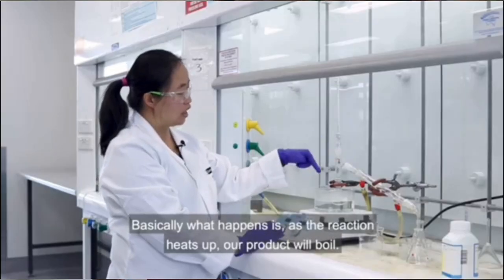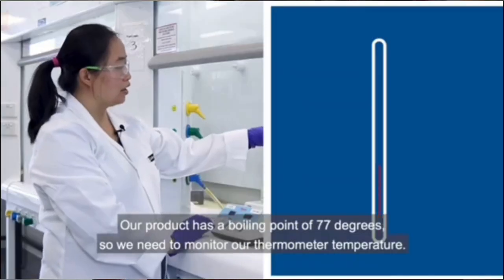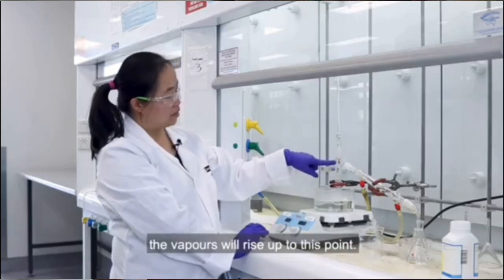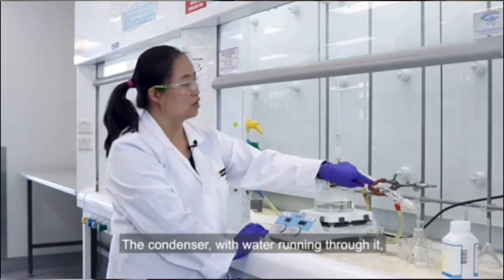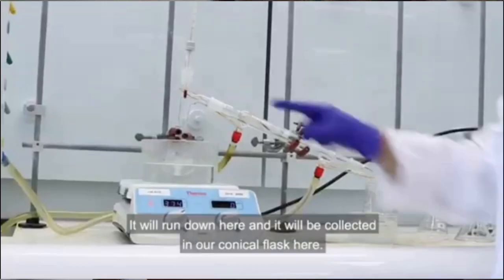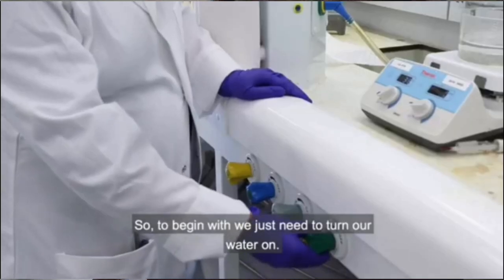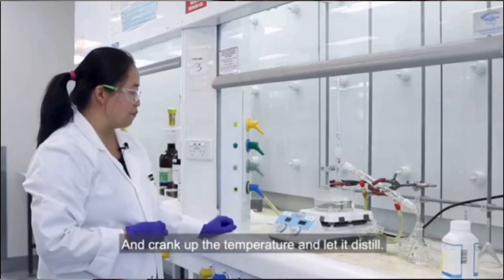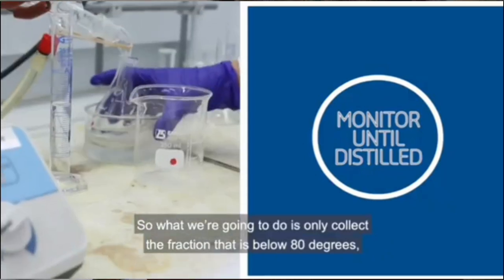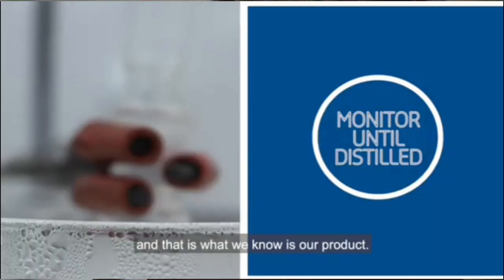Basically, what happens is, as the reaction heats up, our product will boil. Our product has a boiling point of 77 degrees. It will boil first and produce vapors. The vapors will rise up to this point. The condenser, with water running through it, will condense vapors back into solution. It will run down here and it'll be collected. To begin with, we just need to turn our water on, raise the temperature, and let it distill. What we're going to do is only collect the fraction that is below 80 degrees, and that is what we know is our product.